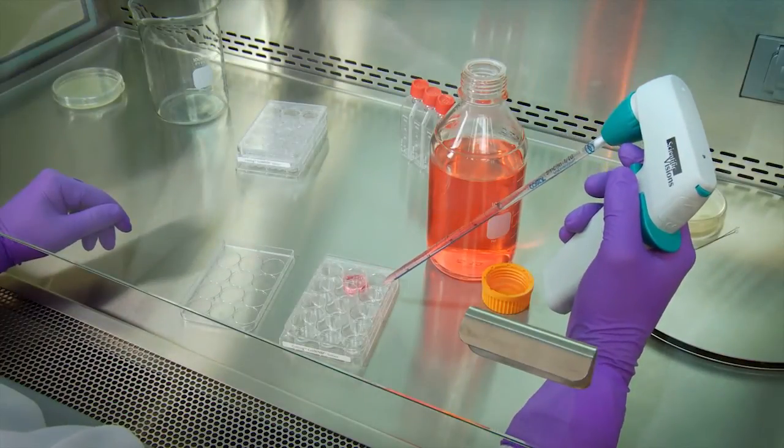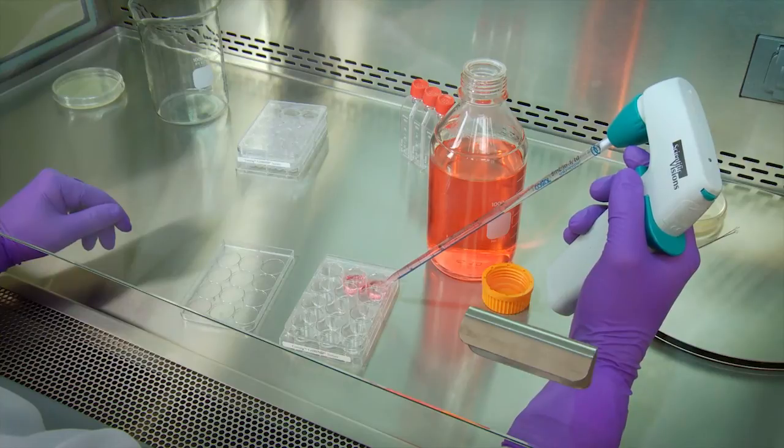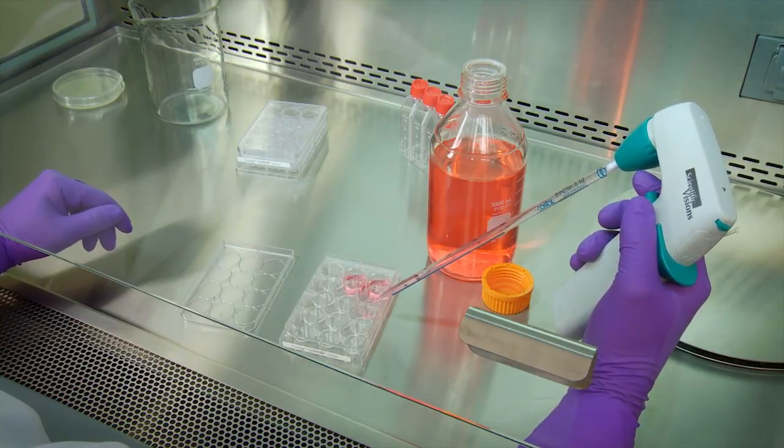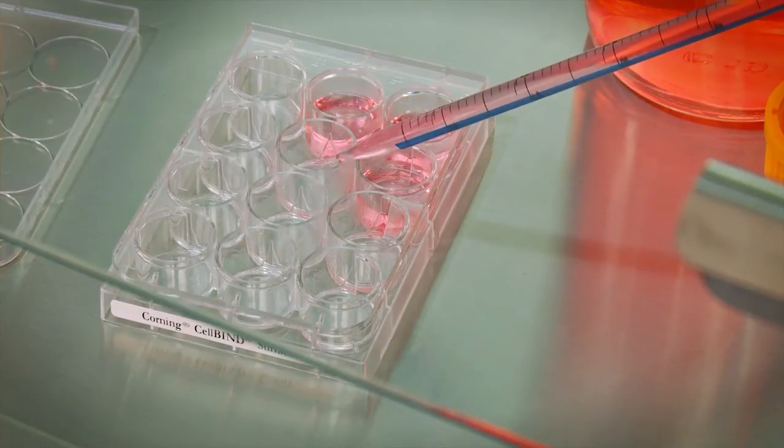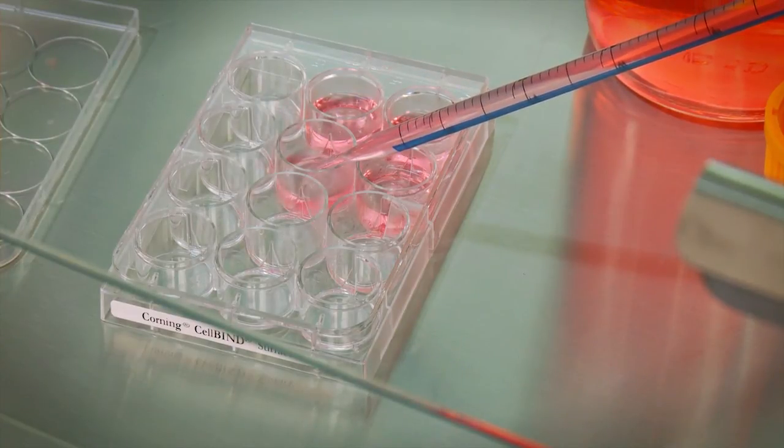Biological safety cabinets were designed to remove or minimize exposures to hazardous biological materials and particulates. They are the principal device used to provide containment of infectious splashes or aerosols today.